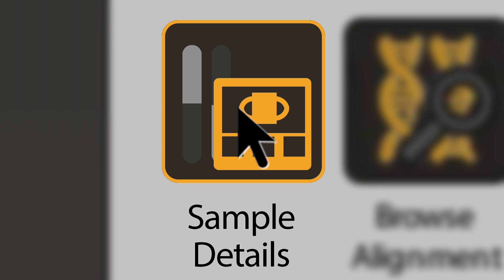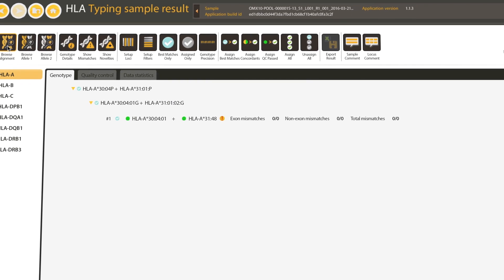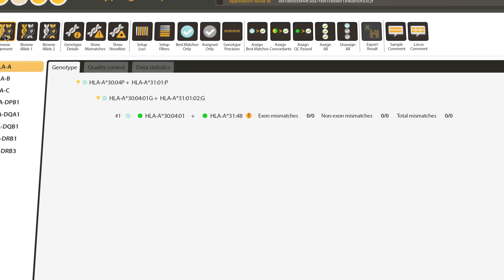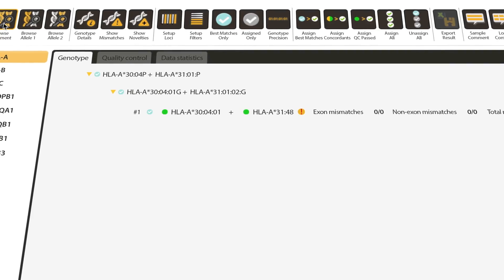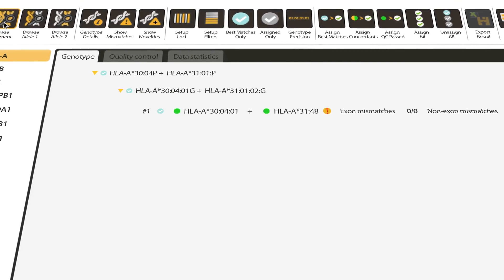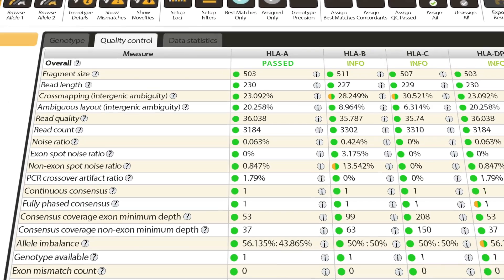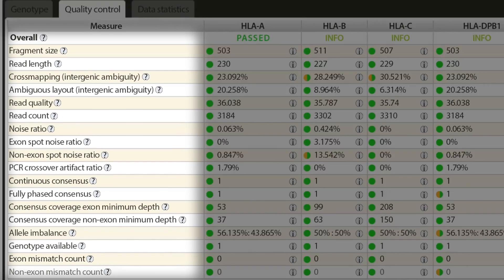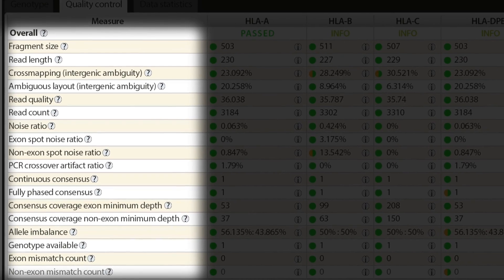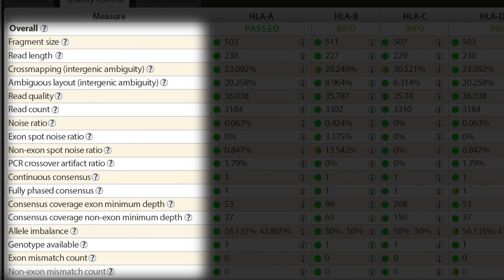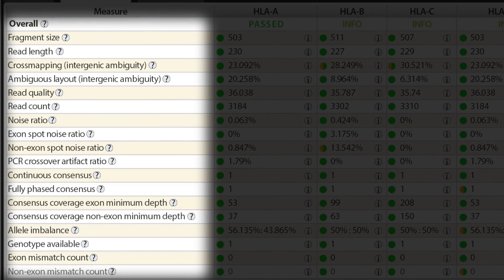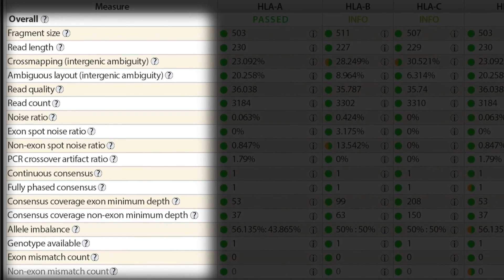HLA Twin has many more details you can investigate for any sample. With 18 different quality metrics, you'll have all the information you need to troubleshoot challenging samples.